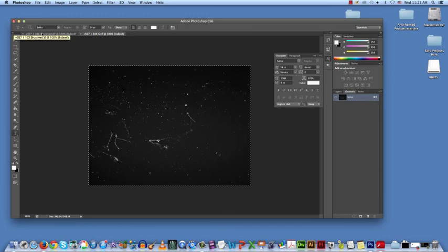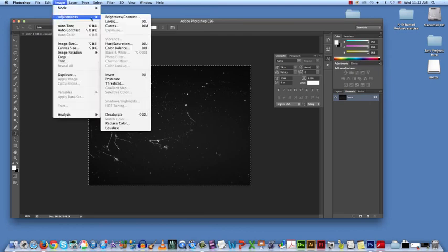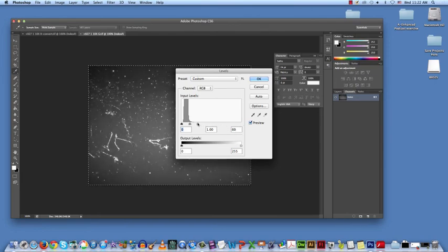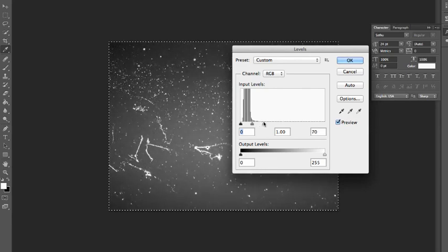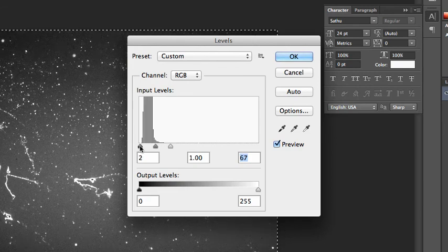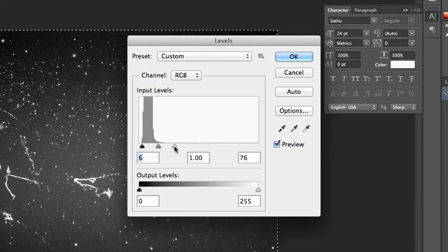Here, first, before we put the two images together and overlay them, I want to make sure that I'm seeing as much of the data as possible. So go to Image, Adjustments, and Levels, and see if you can maximize the information. Clearly, this would be way too bright, but you can see that the signal is really focused on this very small part of the image, and so I want to maximize that signal. There also seems to be a lot of background in this image, and unfortunately that's not something that you're going to be able to get rid of with this analysis.